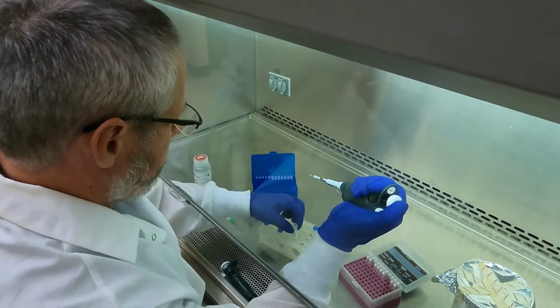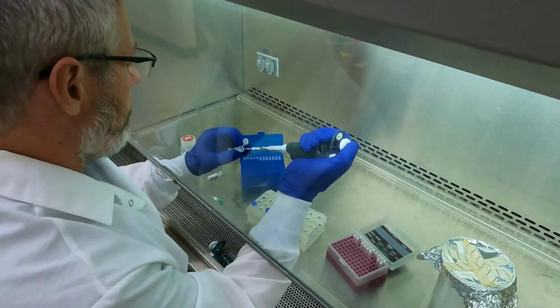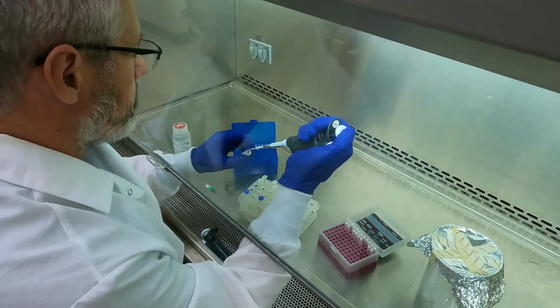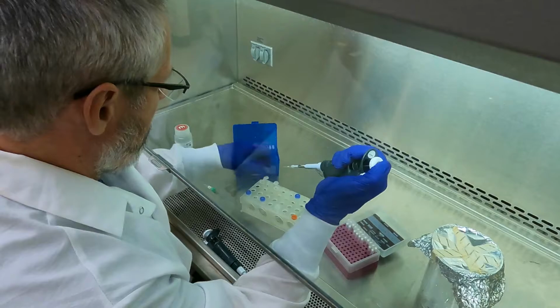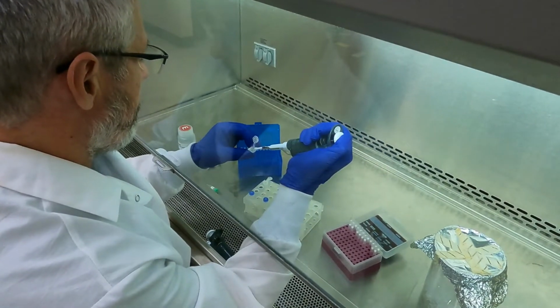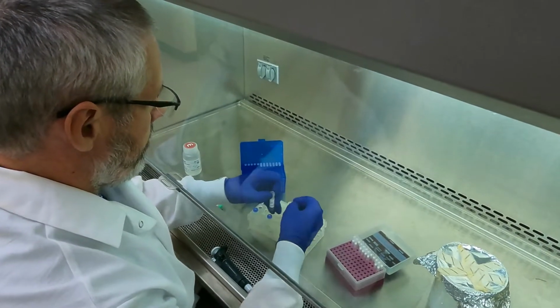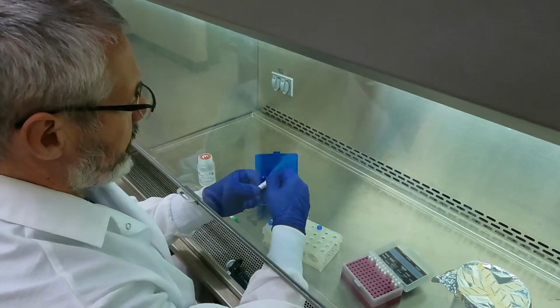It's 5 microliters, and at the bottom. That's the enzyme. It doesn't have the RNA attached to it yet.